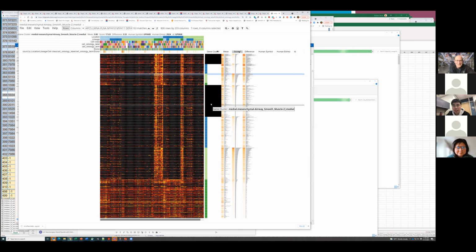Thank you both. Yeah, one thing I want to add is that actually our statistics is pretty limited currently. We only use t-test, frankly speaking. And in other newly published methods, they have more advanced statistics which are better, like modeling the single cell data for their negative binomial distribution property. And it's always better to use a more advanced algorithm to really get the differentially expressed genes. As far as we know, t-test is not that problematic, but there is still a lot to improve here.